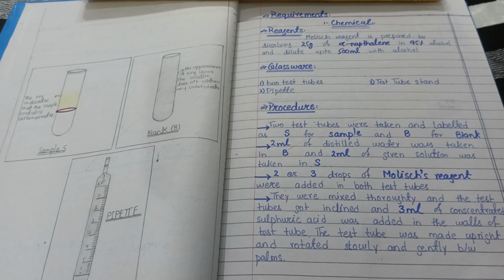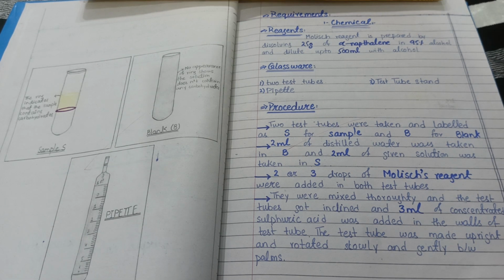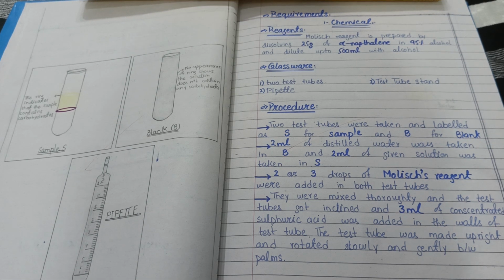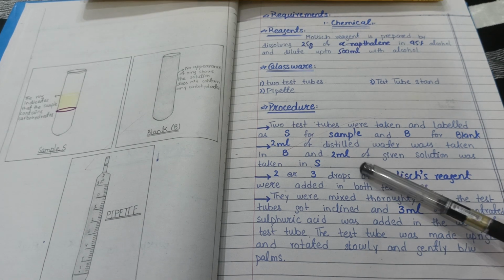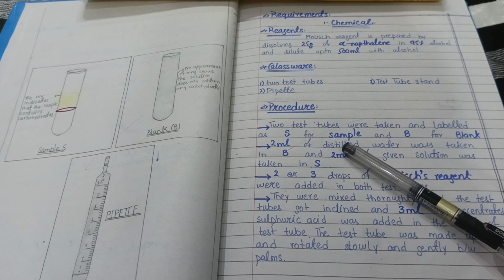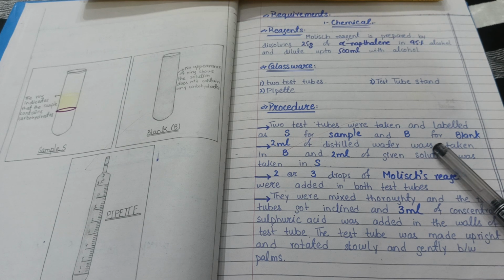Now after preparing this we are going to see the glassware. The apparatus for this experiment is very simple. You just need two test tubes, a test tube stand and a pipette. So how is the procedure going to occur? You have two test tubes. On one test tube you will label S for the sample, and on the other test tube you will label B for the blank.